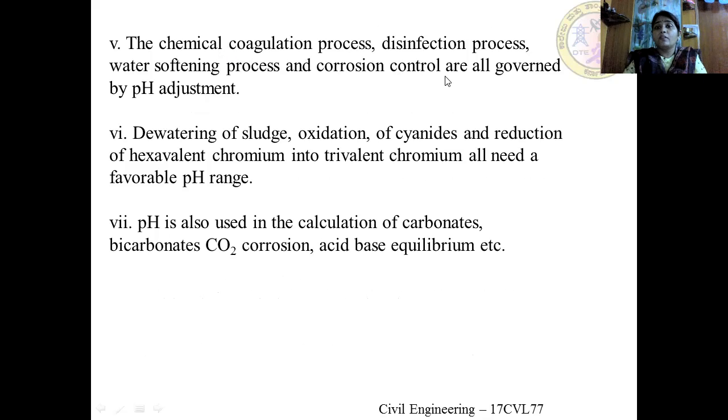In a chemical coagulation process, as we know, in a water treatment process, the various treatments are plain sedimentation, sedimentation aided with coagulation, filtration, and finally disinfection. So when a plain sedimentation process takes place, the various suspended, floating particles settle down. But sometimes the finer particles remain suspended in the water and don't easily settle down at the bottom of the tank.